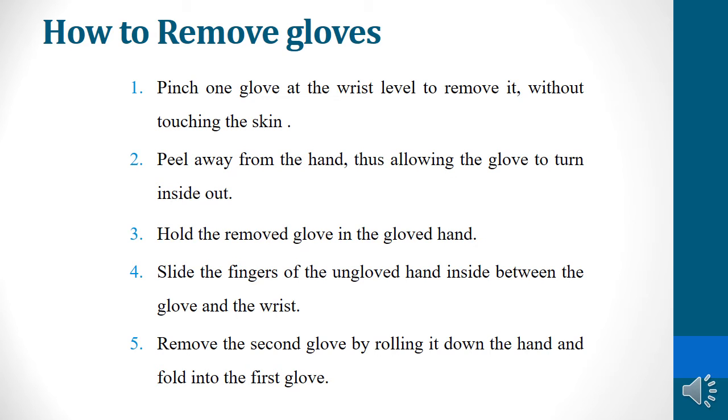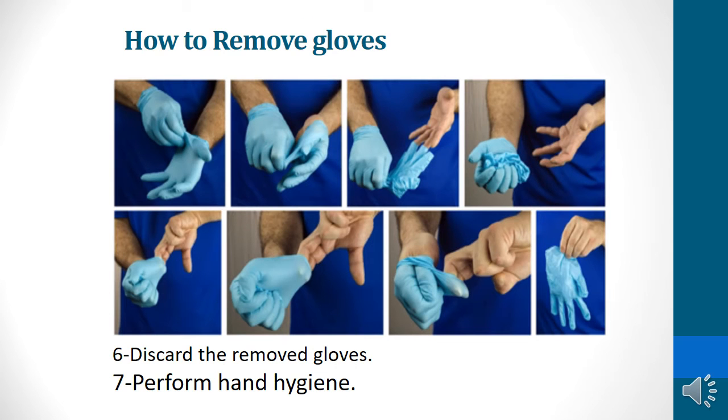We will show you the photo for that. These are the steps for removing the glove. When finished, we will discard the removed gloves, and we have to perform hand hygiene.